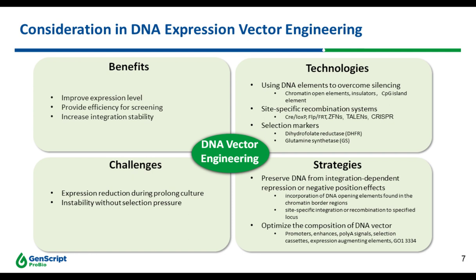Beacon is the most recently developed technology. It's a fully automated live cell selection and screening in nano pens, so they can screen as many as 5,000 individual cells to find the best secretors.